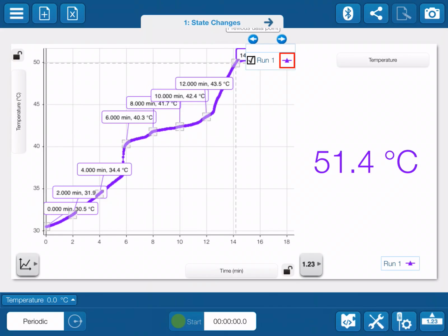So now you can see, if you take a screenshot of this, you can see all the points at once, so that your partner has all of the data that they need in order to graph it, and you can just graph every minute or 2 minutes. You don't need to graph every single 0.0183 minute. That is not necessary.